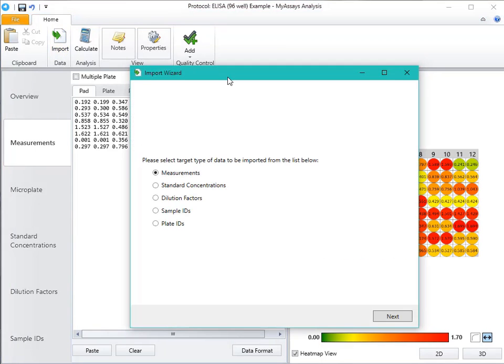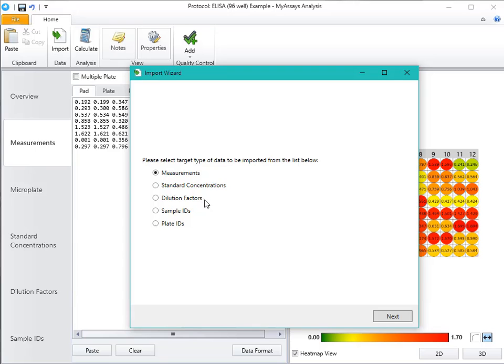You can see when we open the Import Wizard, we also have the opportunity not only to import your measurements, but also the standard concentrations, dilution factors, sample IDs, and plate IDs. For more information about how to use the Import Wizard, please see the video surrounding that topic.